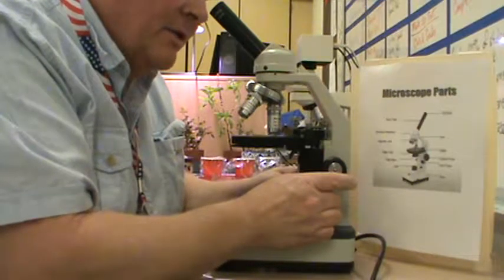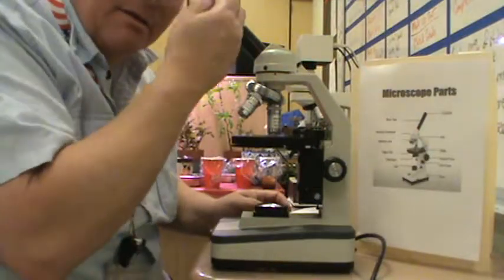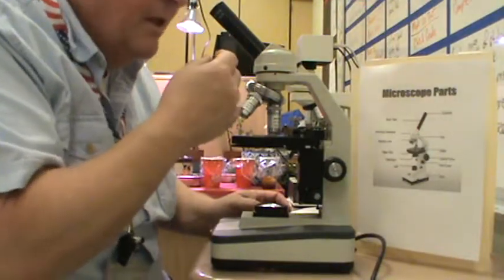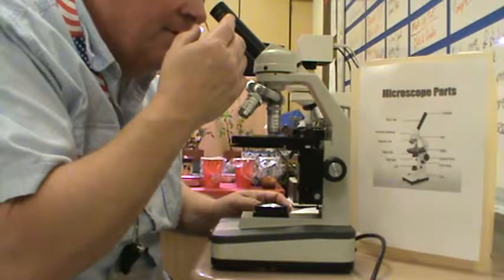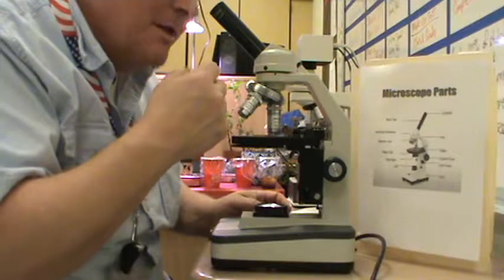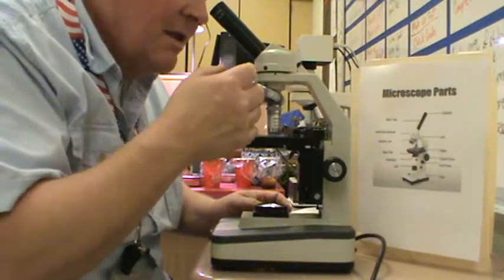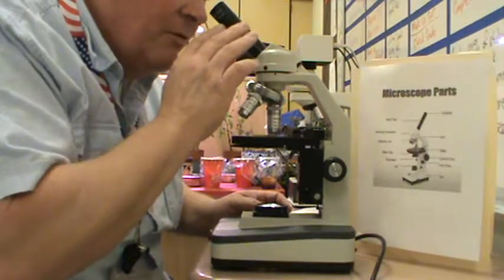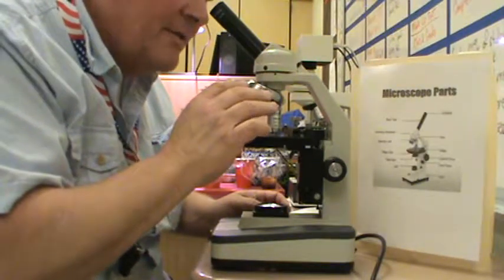And one thing that you're going to notice when you do the higher power, you'll start seeing dust. You might see some floaties. In my case, when I blink my eyes, I see floaties sometimes in this high power. I don't know why that is. It just is. So if you see things moving around in your field of vision, please don't freak out. It's just normal. All of us have them.